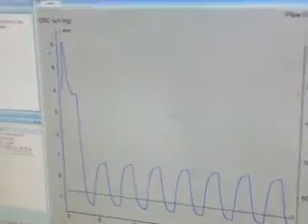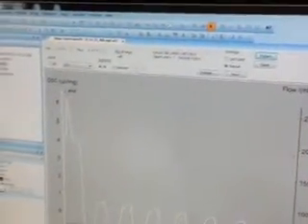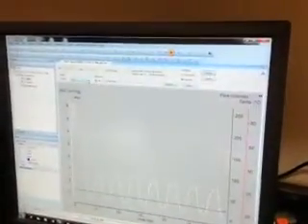So after we get up the data here, we go into extras. We go into export results, and we're going to use it on full range there. Let's see. Do I have this set up right? Oh, yeah, you have to make sure that I clicked on change here.